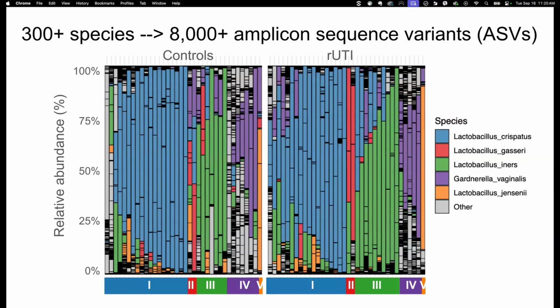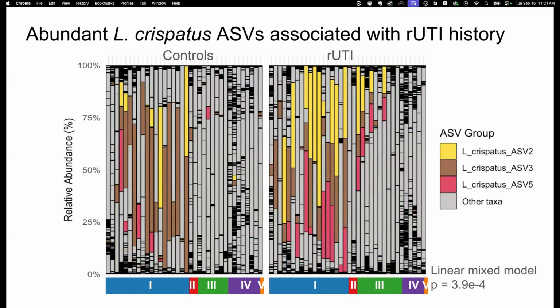over 8,000 ASVs. And we're super excited about diving into these data to get a sense of diversity over time and over space, different habitats in these individuals, since we have the urines, the gut samples, and the periurethral swabs. But what I want to focus on right now is that we were excited to take another shot at asking whether there was something special about our rUTIs versus our controls, just in general. So that's these data here.